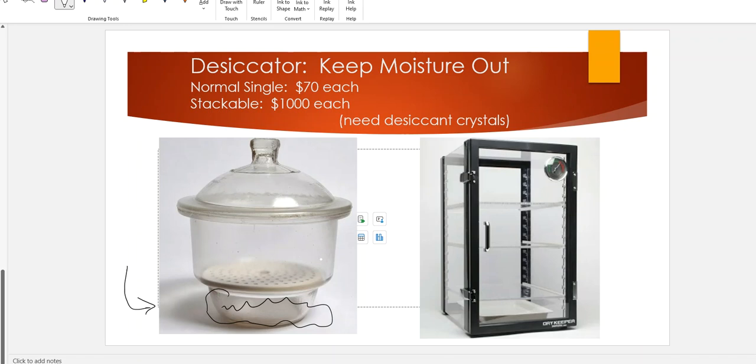Often there is some type of grease over the lids, and that is very important because that grease is going to prevent all of that moisture from making its way to the inside. So that greased lid is going to give you a kind of airtight seal, and then the desiccant down there at the very bottom will absorb any moisture that might find its way in as you open and close the lids. And that could be silica, or it could be special types of desiccants that we use. There are different materials that can go on the inside. It just really depends on what the lab needs and what they prefer to use, and what material they're working with. Sometimes they're told what to use.